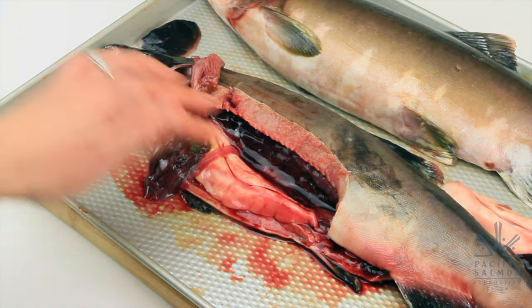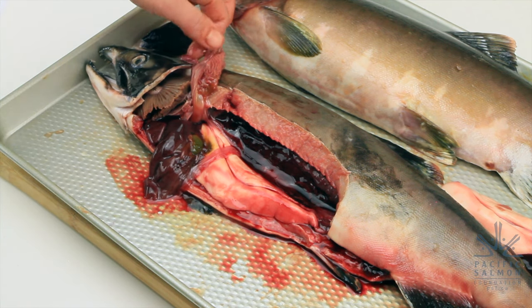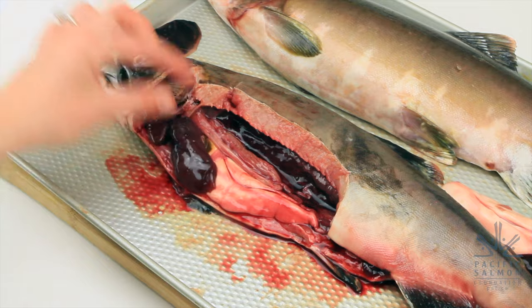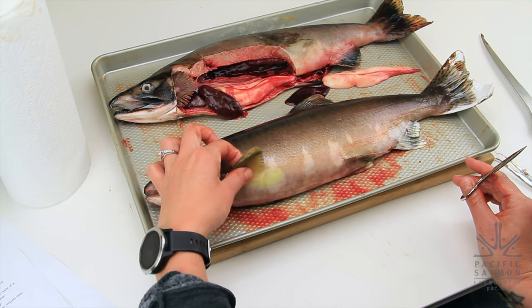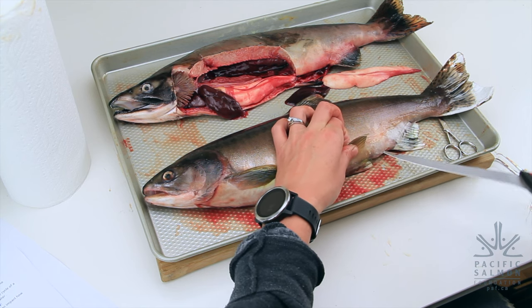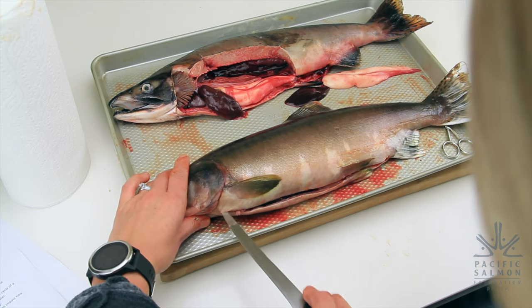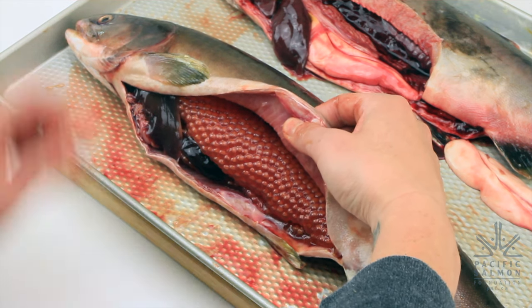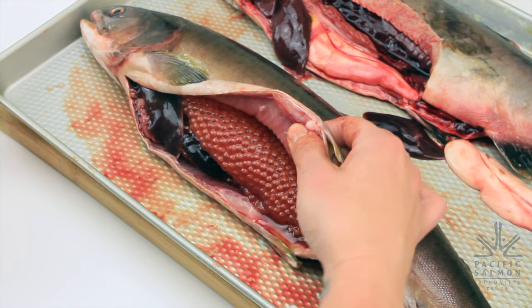Now we've looked at all of the internal features of our male pink salmon. We'll move him out of the way and take a look at our female pink salmon, so you can see the difference between what the male organs look like and what the female organs look like. Here is our female pink salmon — let's see how her inner features look a little bit different than our male's inner features. What is the first thing you notice about the difference between the inside of the female salmon and the inside of the male salmon?